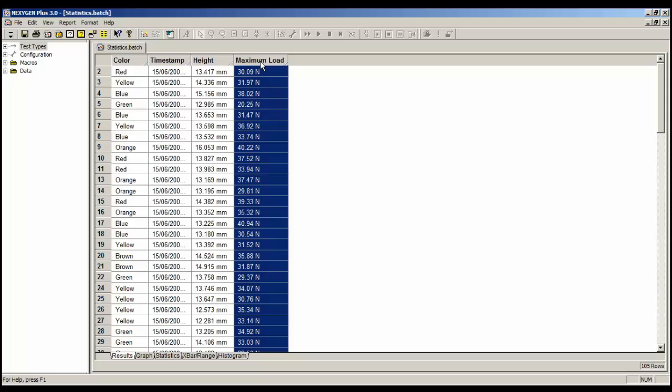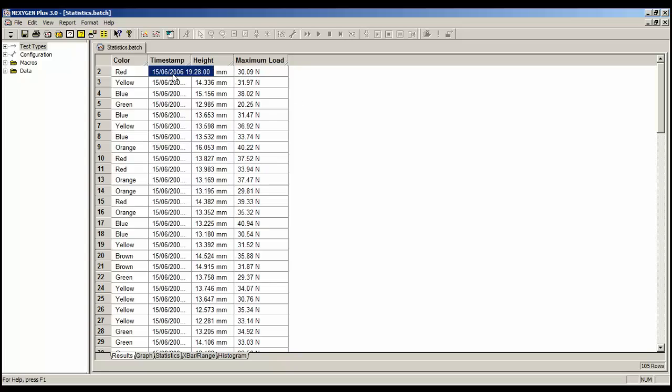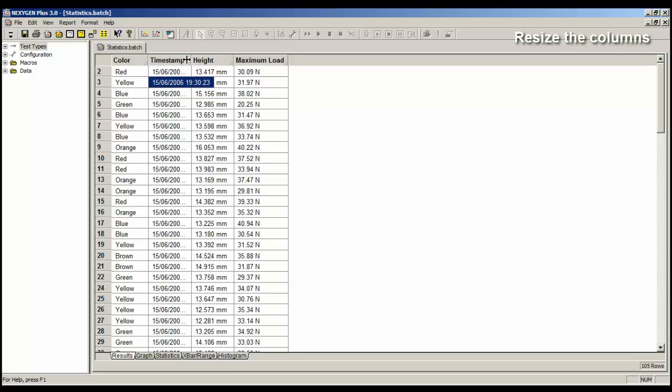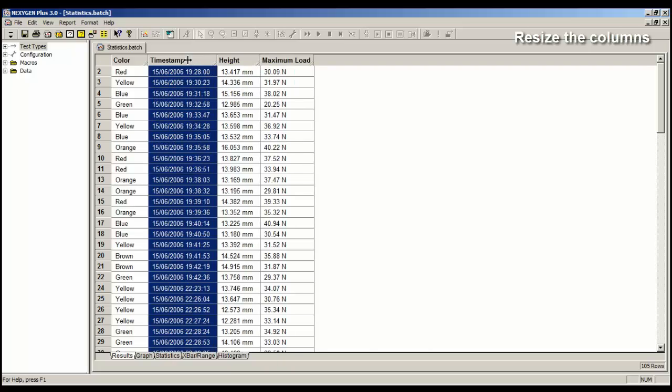There are two things I can show here. The first is that the timestamp column is not wide enough to show all the data. So to fix this, place the cursor at the right-hand side of the timestamp header, and we can see that the cursor changes to a cross, and then double-click. The column will then automatically widen to show all the data.